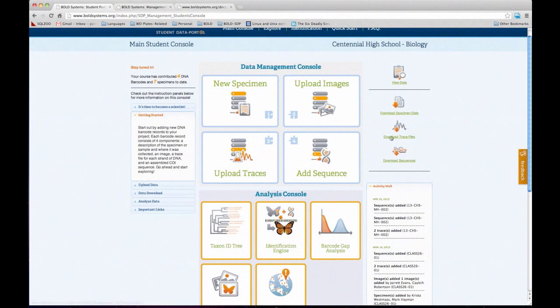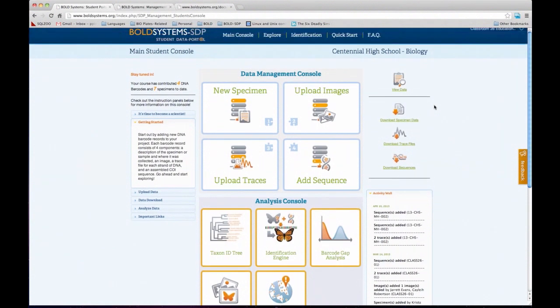Students can also view and download data — all the specimen data for the class, all the trace files, and all the sequences. If they want to do other analysis or investigate differently, or if you have a project in mind that they can use this information elsewhere, it's all available to them.